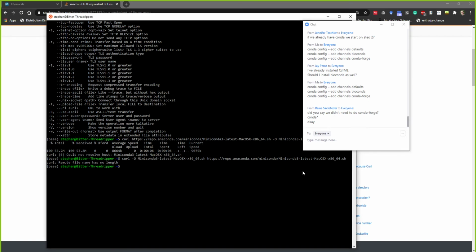Do we want to keep going on the BioConda website after those 3 commands? If I'm finished with those, the install packages? No, that's all you need to do. So those 3: conda config add channels defaults, add channels bioconda, and the third? Yep, those 3, and run them in that order, and that'll be all.